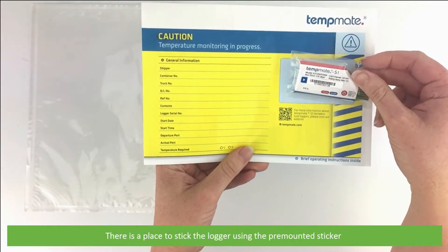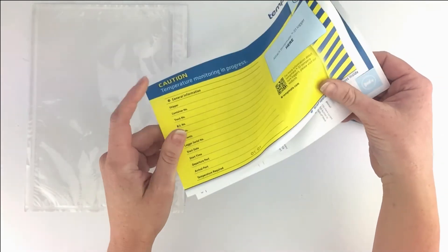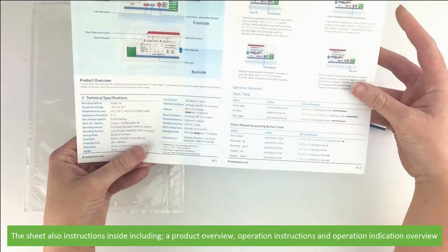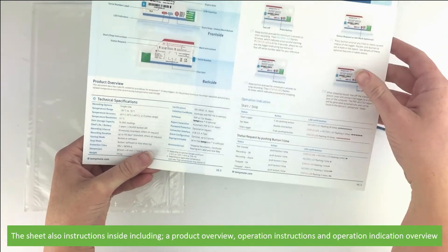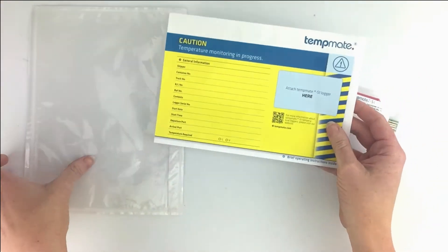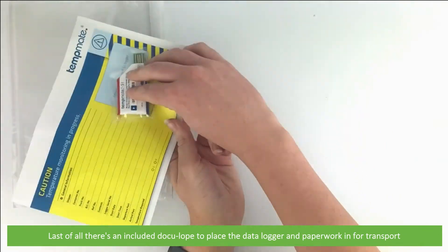There is a place to stick the logger using the pre-mounted sticker. The sheet also has instructions inside, including a product overview, operation instructions, and an operation indication overview. Last of all, there's an included docu-loop to place the data logger and paperwork in for transport.